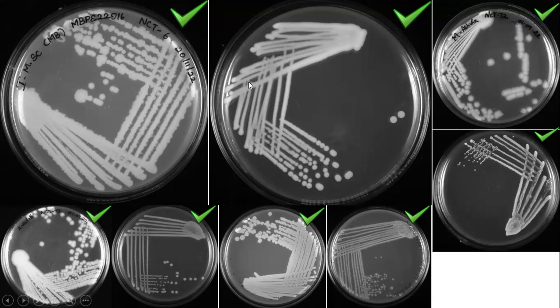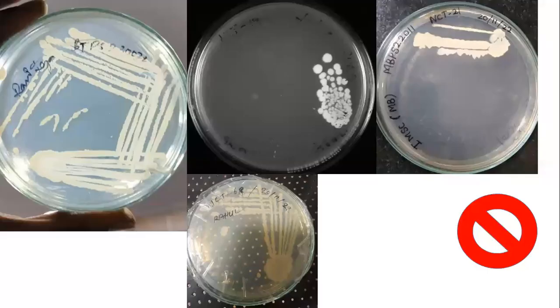From the last three lines, make six more lines in the second quadrant. See, from the last three or four lines, you can make another line, and if you do this, I would guarantee 99.9% of the time you will get an isolated colony in the last quadrant. So that's how quadrant streaking is done. These are the things you can do. These are the things you should not do.